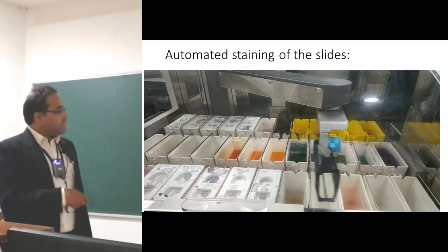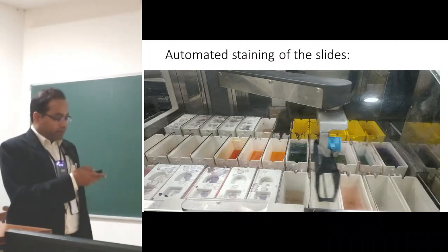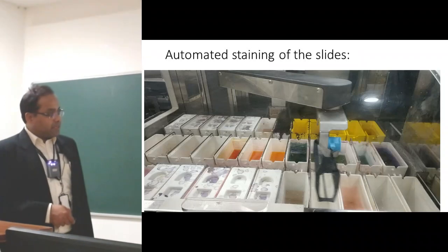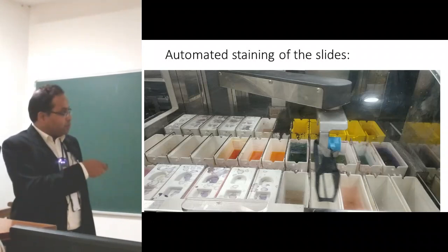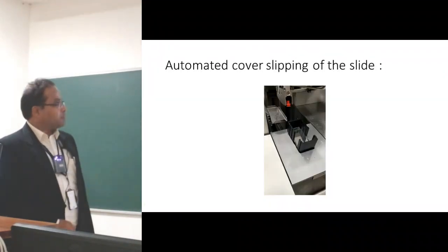Now this is the same robotic container. From here it has come to this end. Now this is the robotic arm containing the sections that I showed you in the last picture. These were all videos, but somehow it's not working.